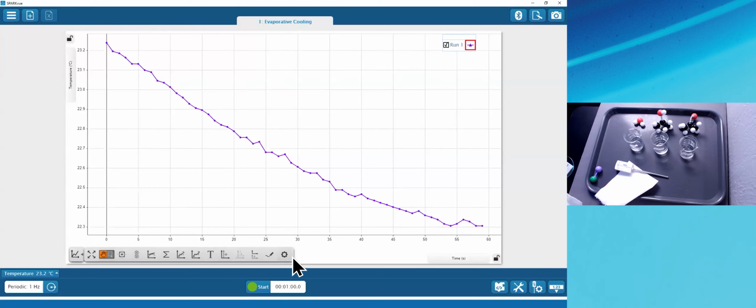Here's a whole bunch more analysis tools. We're not going to get to all of them today, just the ones that we use in Essential Chemistry labs. Okay, so there's that. That was that run. Now the next run says, let your sensor sit for 1 minute to come to equilibrium in the isopropyl alcohol, and predict what you think will happen. After a minute, take that sensor out of the solution and watch what happens while you're recording that 1 minute run of data.